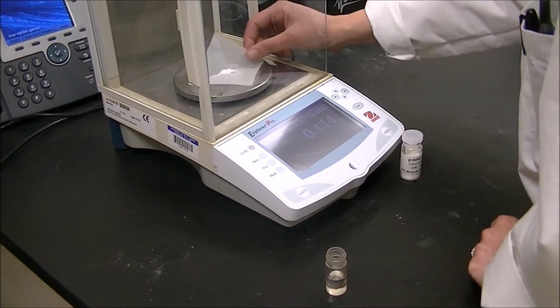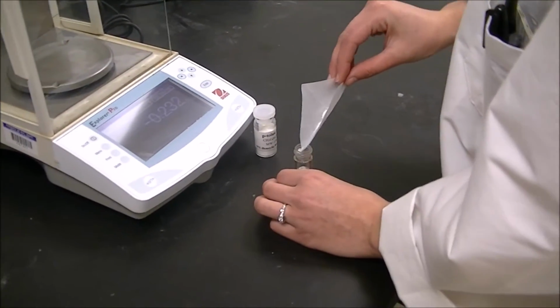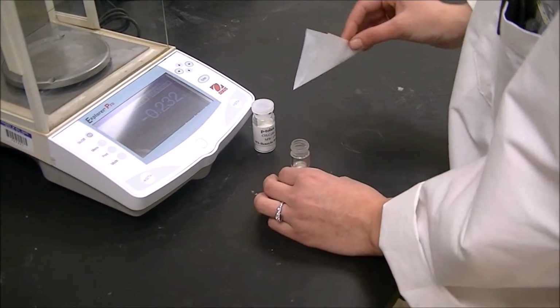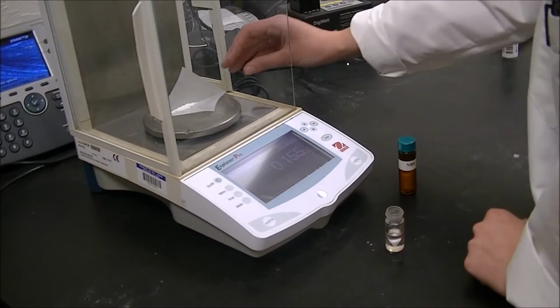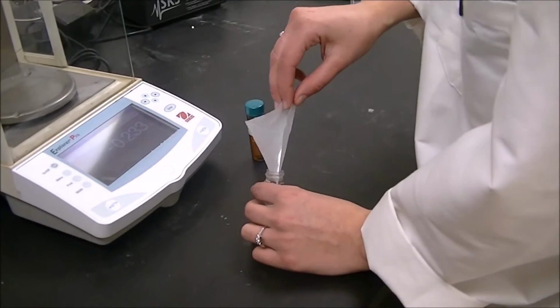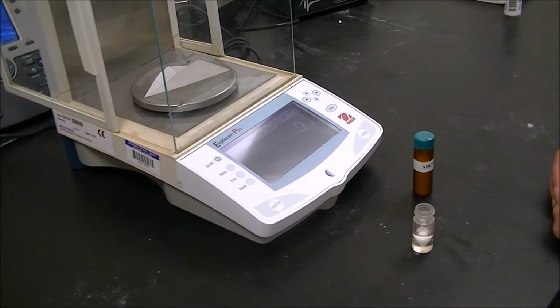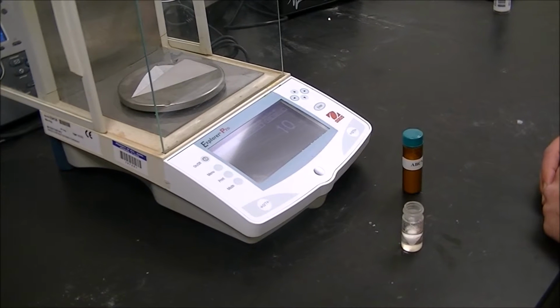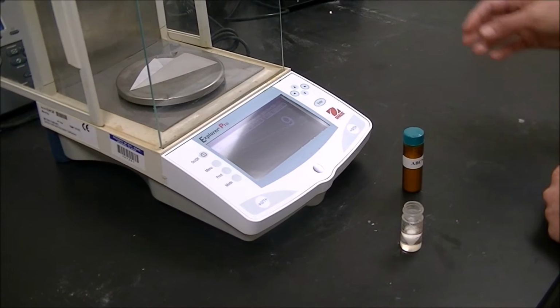Weigh out 0.11 grams of toluic acid and combine it with the chlorobenzene in your conical vial. Weigh 0.15 grams of NBS and add it to the conical vial. Once you've added your chlorobenzene, your toluic acid, and your NBS, weigh out 9 milligrams of ABCN and add it to the solution.